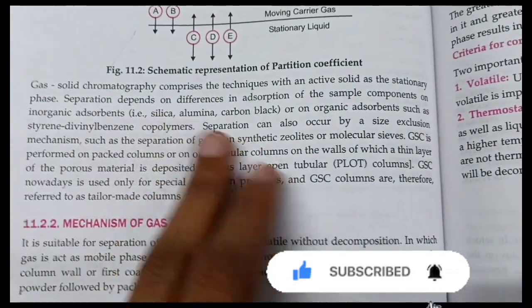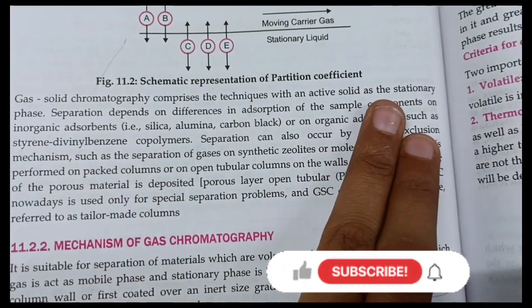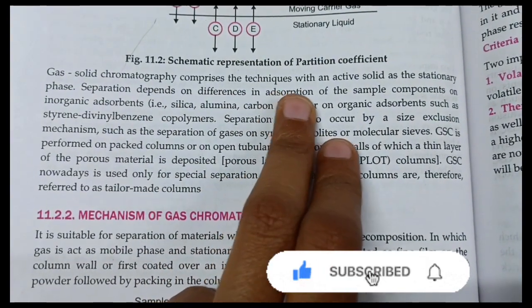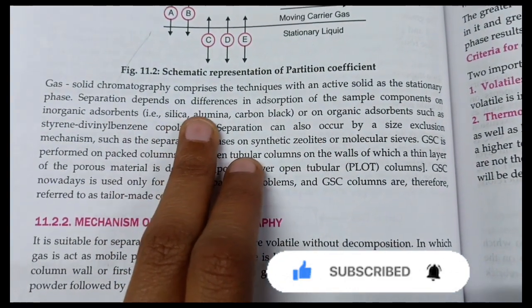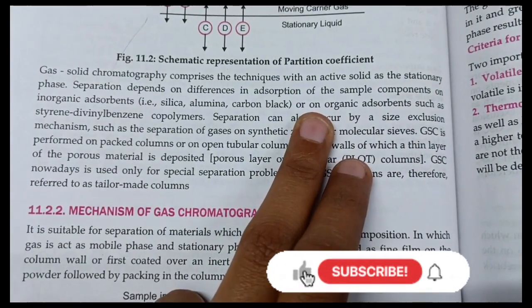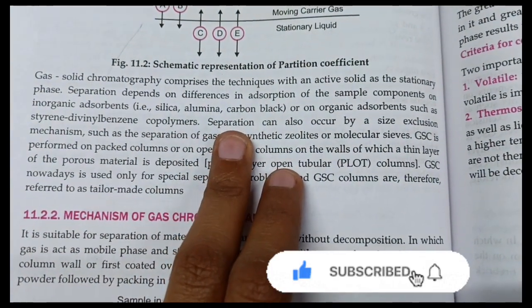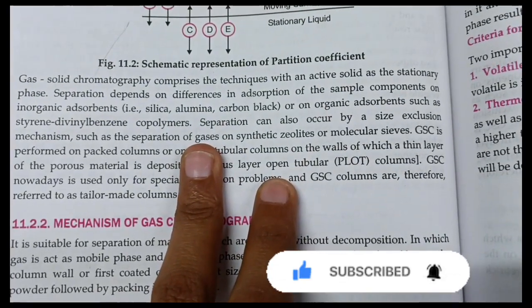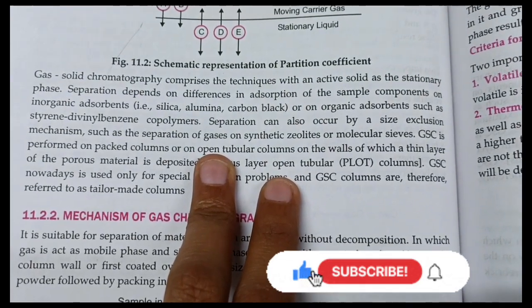Gas solid chromatography is a technique with an active solid as a stationary phase. Separation depends on the difference in adsorption of the sample components on inorganic adsorbents such as silica gel, alumina, carbon black, or on organic adsorbents. Separation can also occur by a size exclusion mechanism, such as the separation of gases on synthetic molecular sieves.